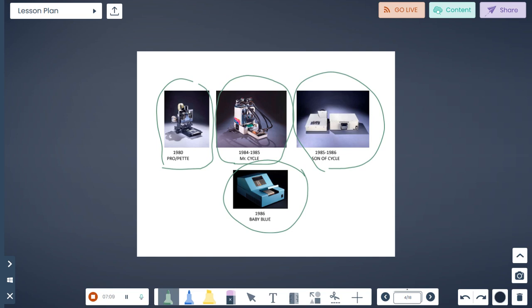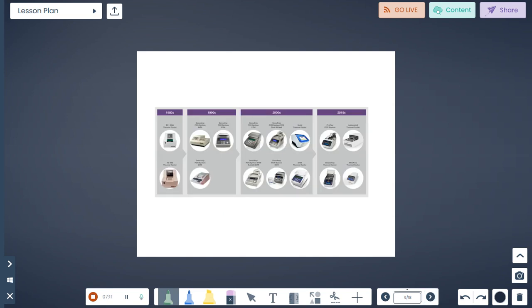So these are the different PCR machines, those used earlier and those currently in use. Earlier, these were all single block PCR machines. Now you have a multi-block PCR machine, and even in a single block you can set a different annealing temperature.